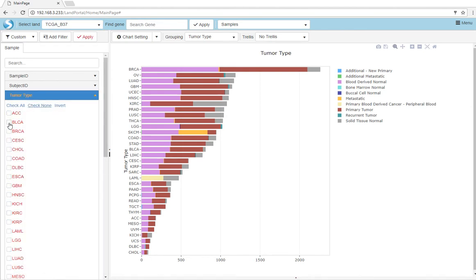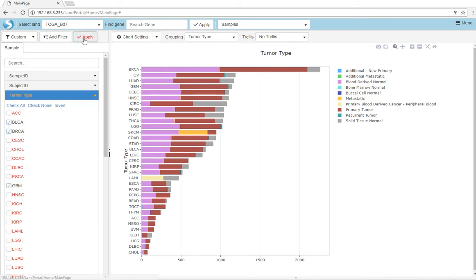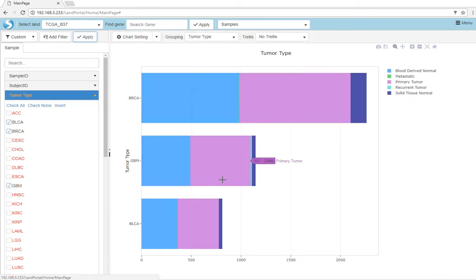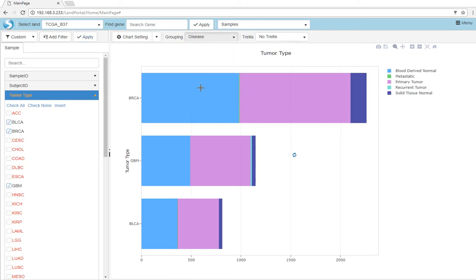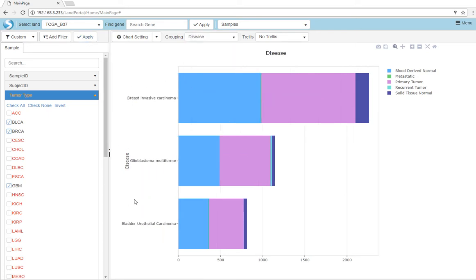Here we will select for bladder cancers, breast cancers, and glioblastomas. Clicking apply will instantly update the view. Users can control the grouping for each view, such as changing to disease, to display the full name of tumor types.